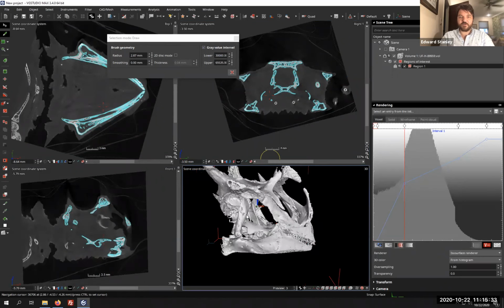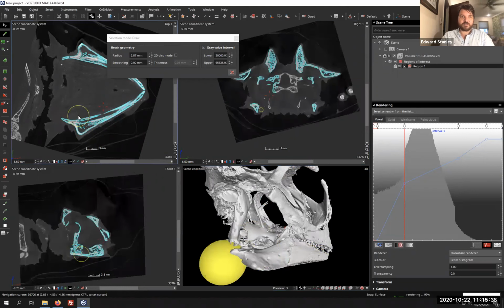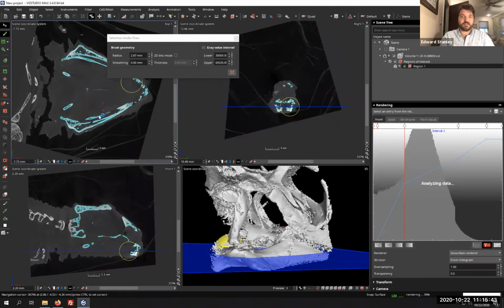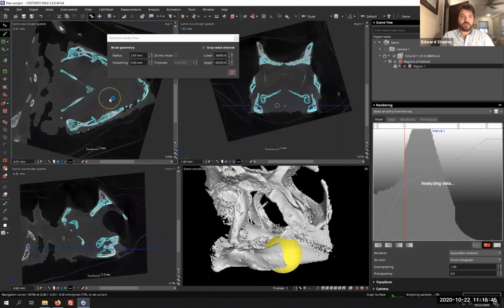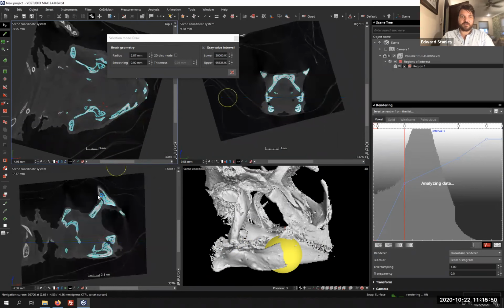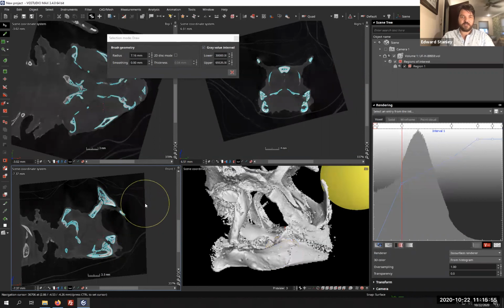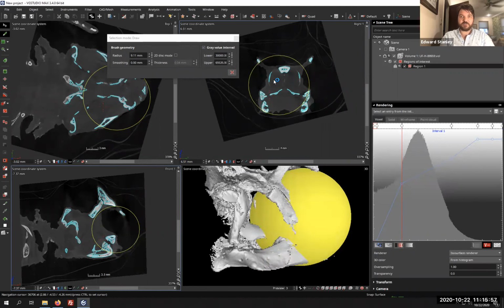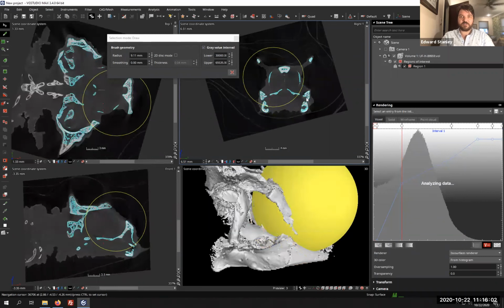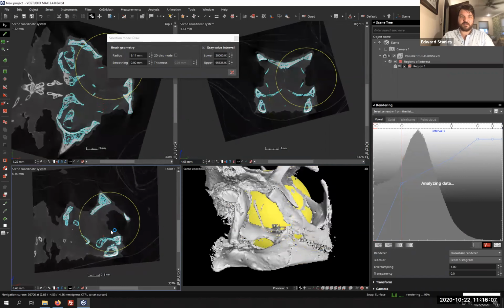So you see, as you go in real time, your 3D window is going to capture your new additions to the region of interest here. As you move around, scroll through and up and down, you can see this. All right, so what we can do is make the pen tool really, really big, and that'll make it go much faster, although we lose a little bit of accuracy with this. Let's click on this a couple of times just to get most of the specimen added.